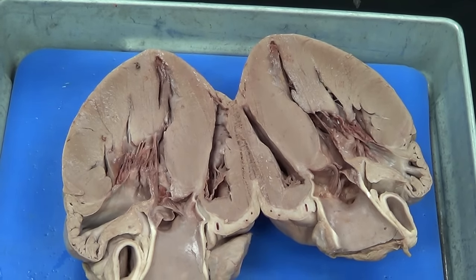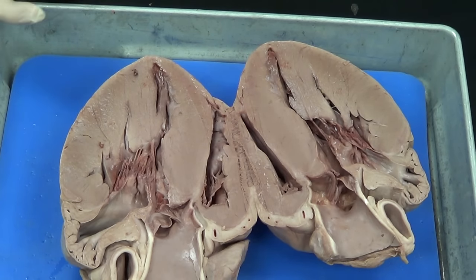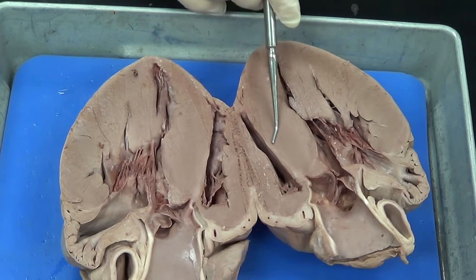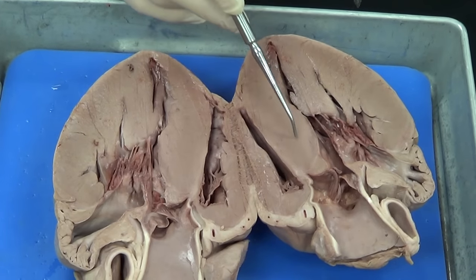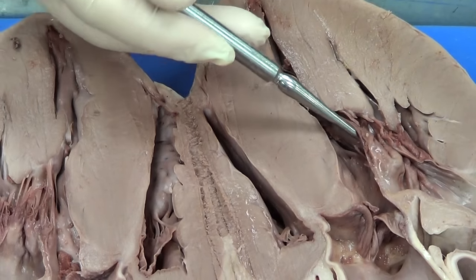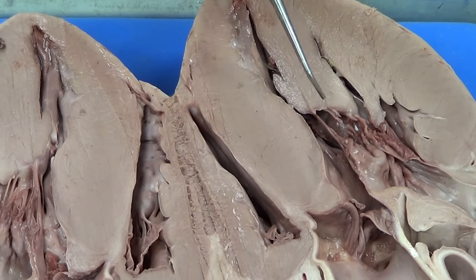We're going to look for something we're familiar with. Most people are familiar with the left ventricle, because it's the biggest, thickest, most muscular chamber in the heart — and it's easy to find. It's big and muscular because it's going to pump blood to the entire body. Looking around, I can see all this very thick muscle here. That is the thickest chamber, and since it's so thick, I know that this is going to be my left ventricle.